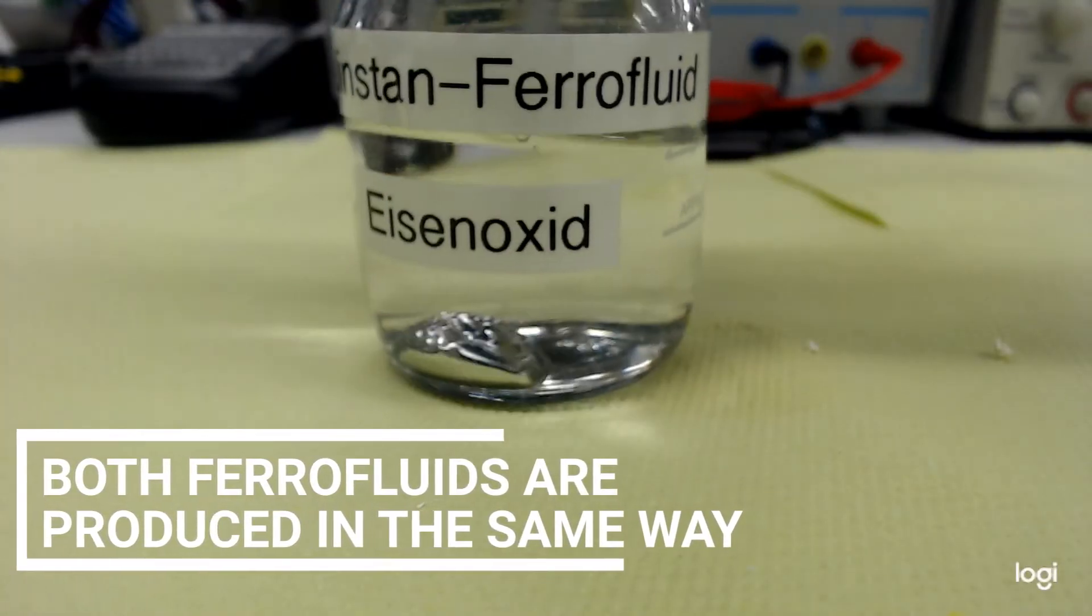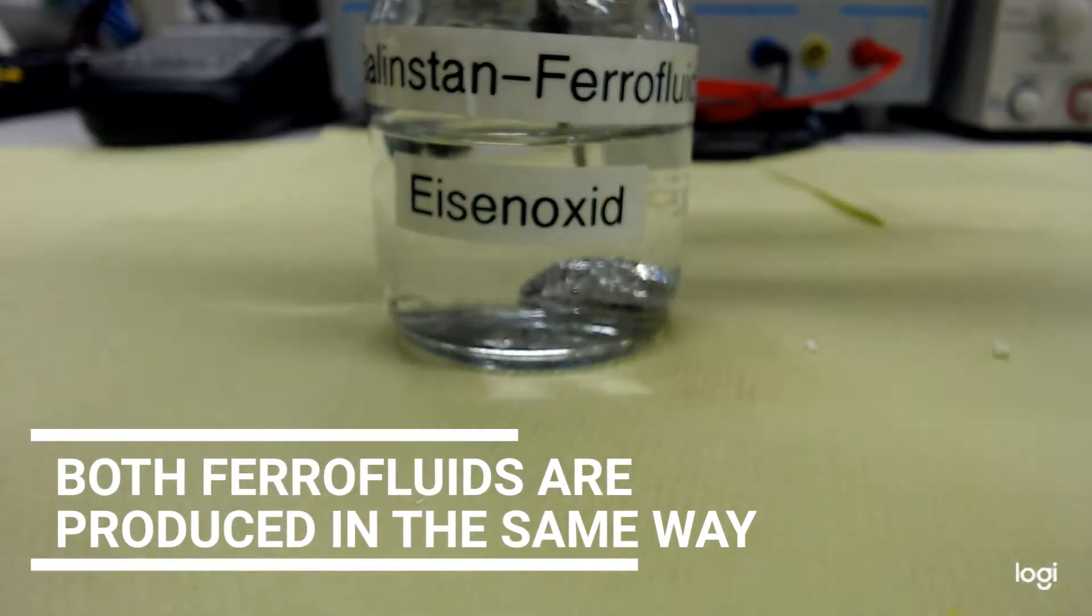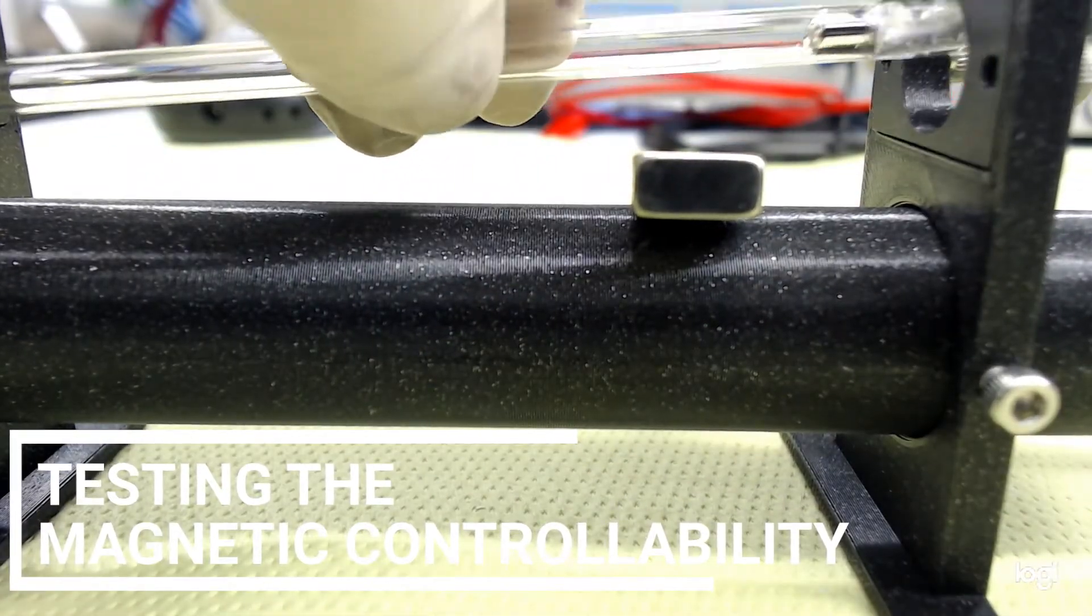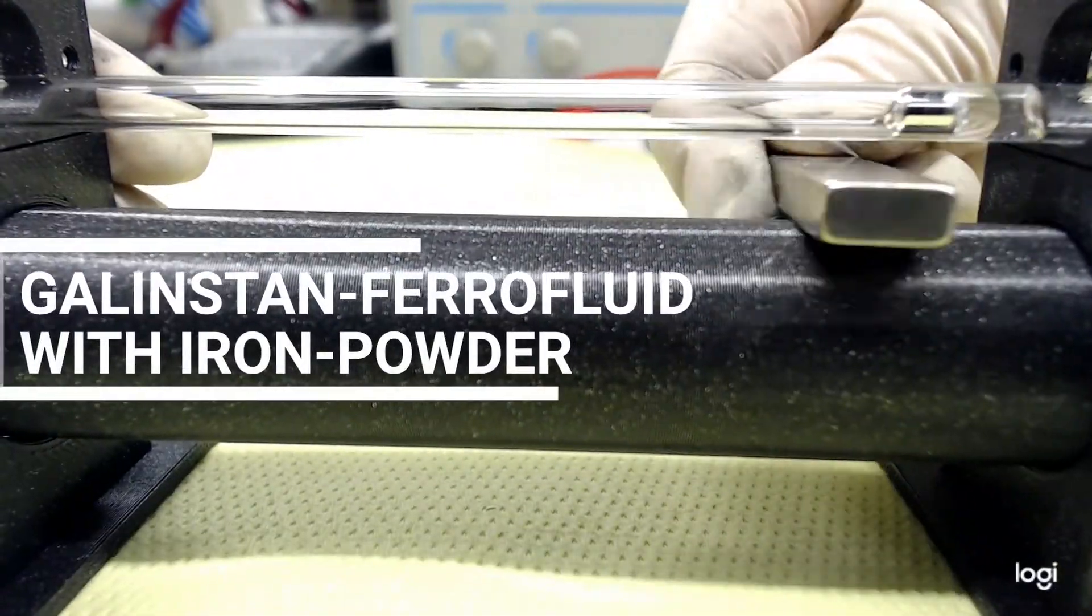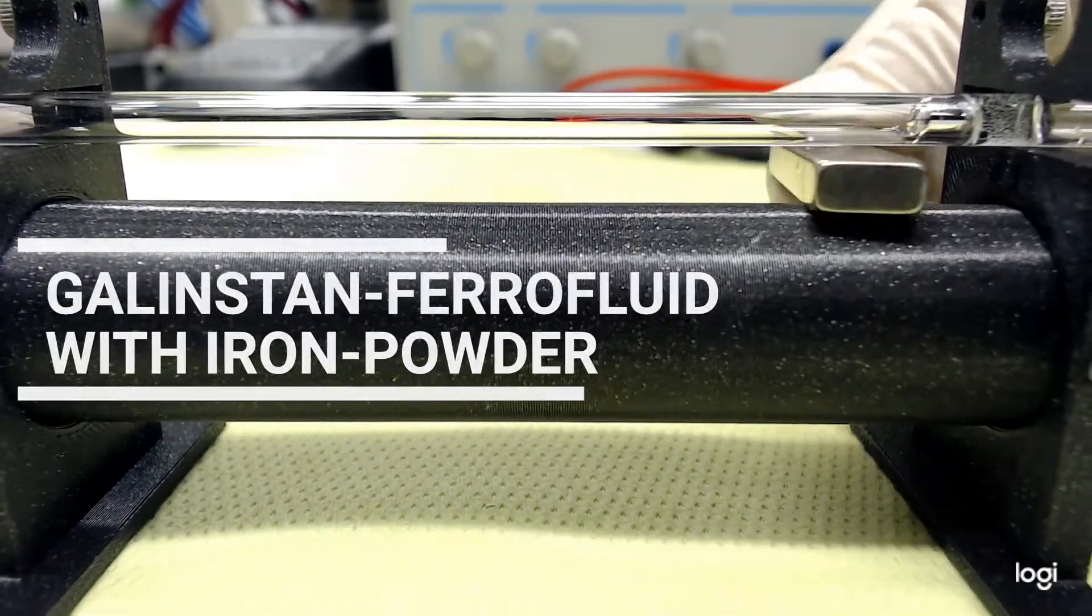Both iron as well as iron oxide dust Galinstan are produced in the same way and can now be tested. But unfortunately, we do not see a response even when applying a strong neodymium magnet to the newly formed material.